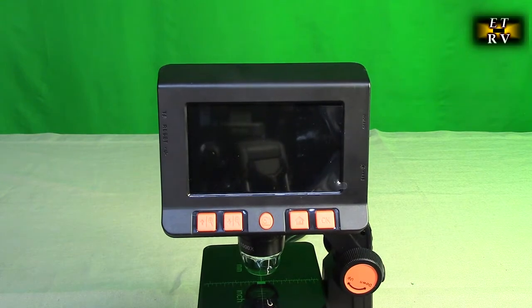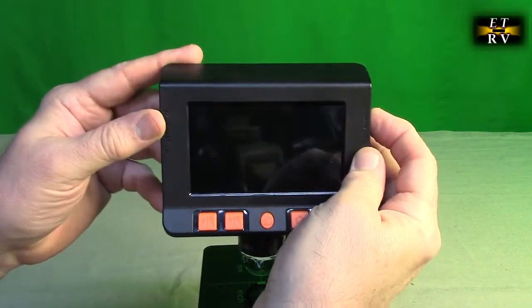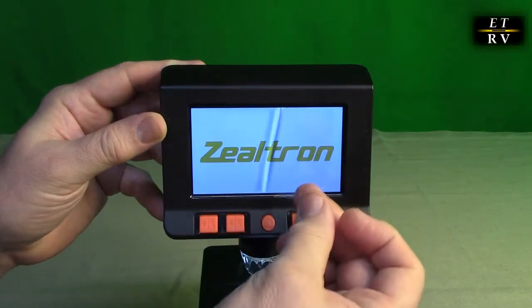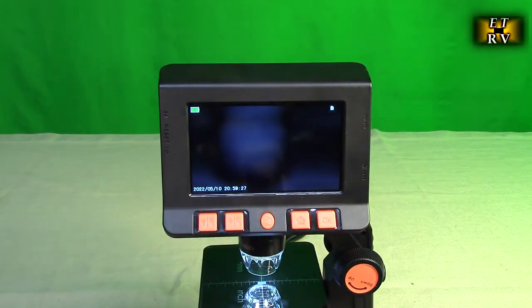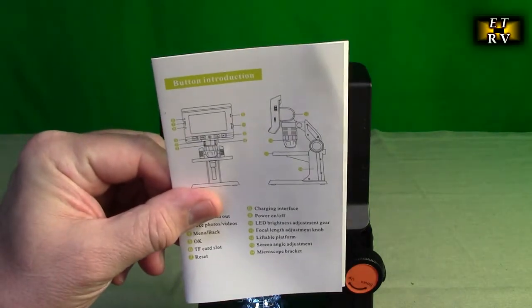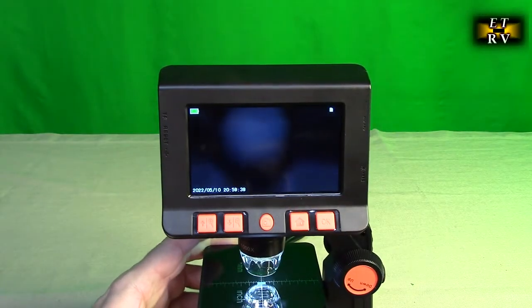Let's start off by turning this unit on. On the side we're going to hit the power switch. Now we're going to take this plastic piece off that you see, because you want to have it nice and clear. The unit does come with a basic instruction booklet also to help you out, but I'm going to show you everything you need to know.